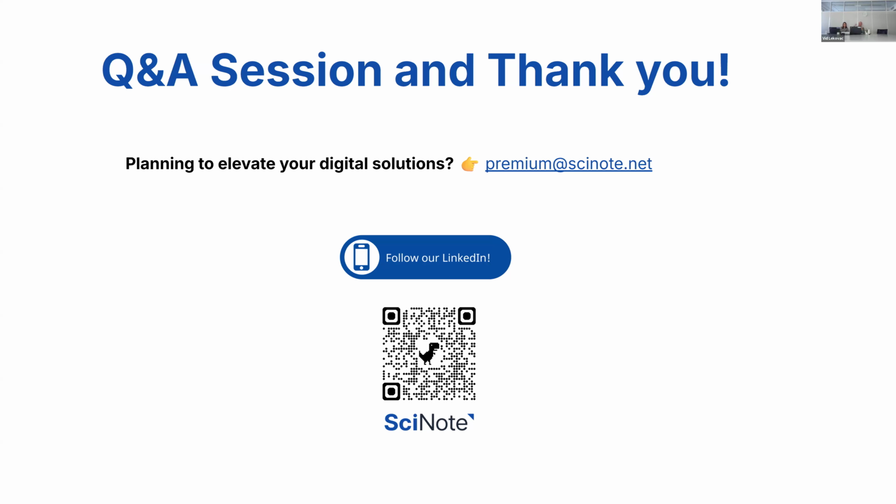The stock that you would create would actually be a number of, I don't know what kind of material you're deducting from, but yes, you can create a custom unit and then deduct that custom unit. We can also maybe follow up later to see exactly your use case and see how we can help. Andy, we're going to also follow up with you and make sure that the answer was the correct one. Let's check if there are any other questions.